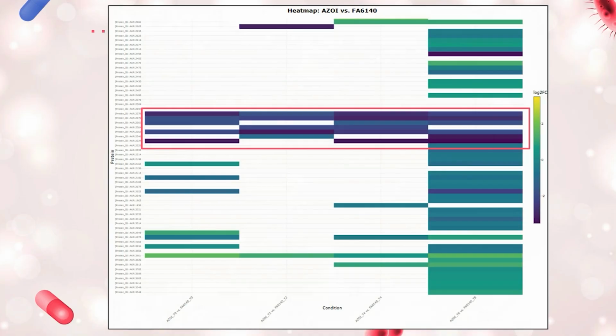So zooming in on that, we notice that it's all like multiple shades of blue. Blue is referring to a lower abundance, or lower potency, so lower abundance. And seeing all those closely isolated proteins makes us consider that these proteins could really be involved with the resistance factor.